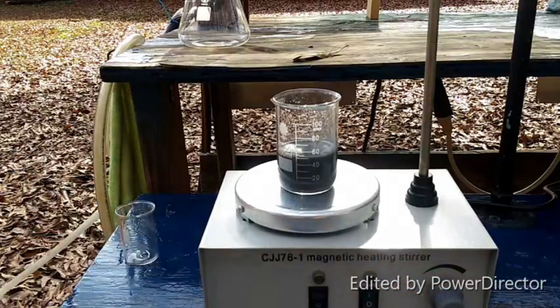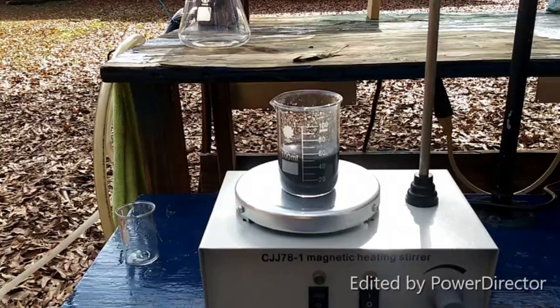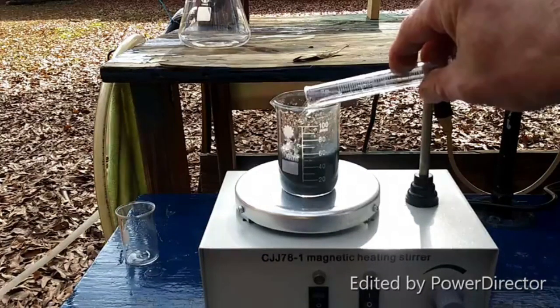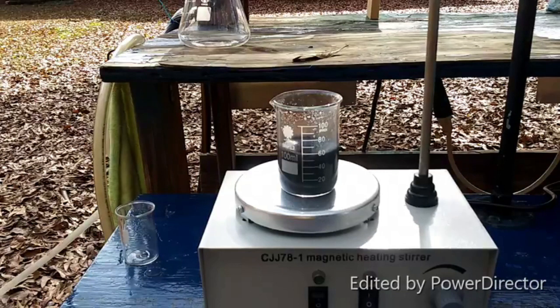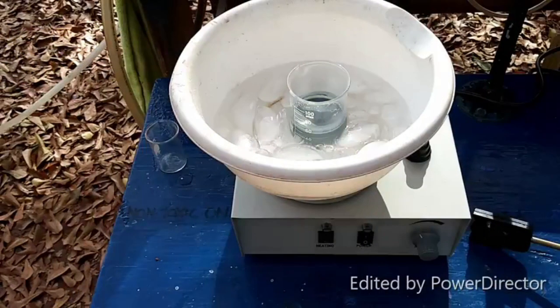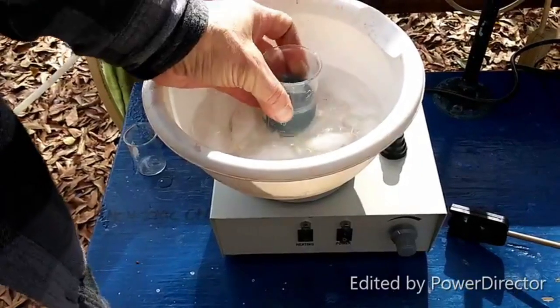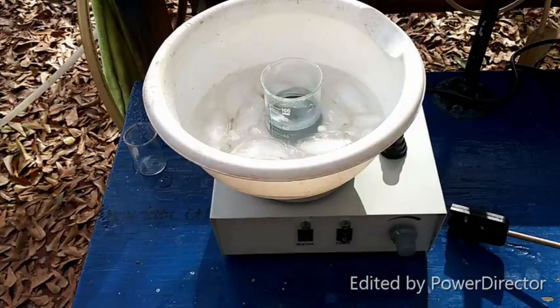We're supposed to stir it vigorously — not really sure for how long though. We're going to let this go for a few minutes and then move on to the next step. I had to cool things down a little bit because the reaction was exothermic. The source said to keep it under 20 degrees Celsius, which is about right. Given that the compound is air-sensitive, I don't want this stirring for too long, so we'll go ahead and see if that cuts it.